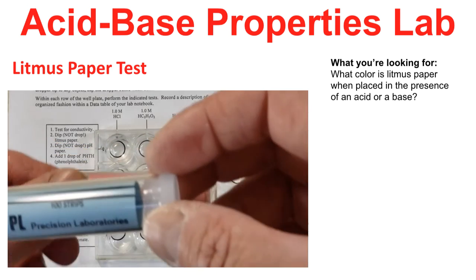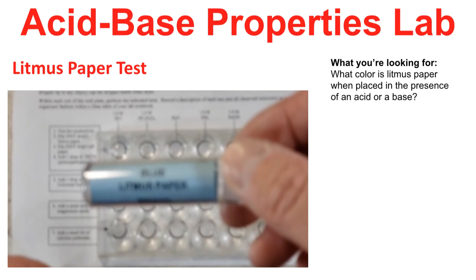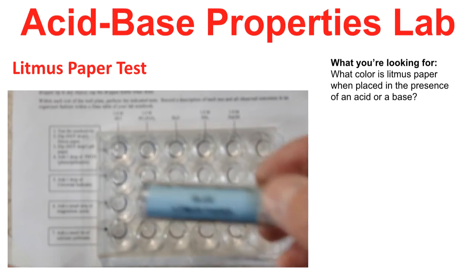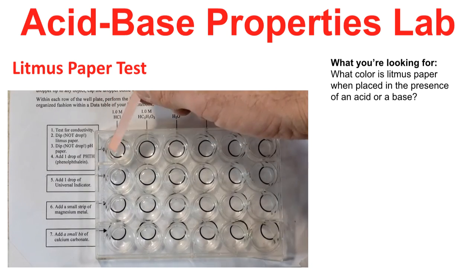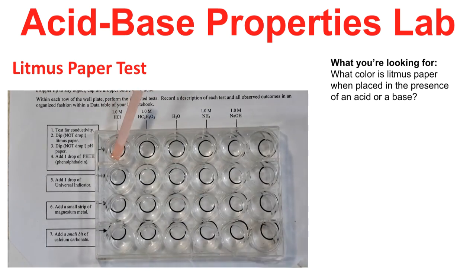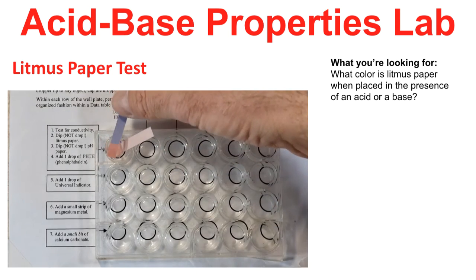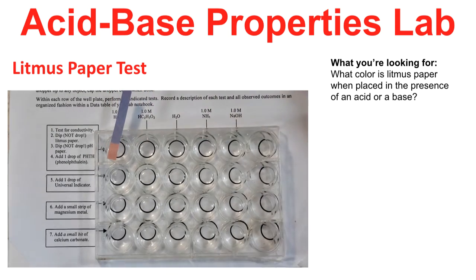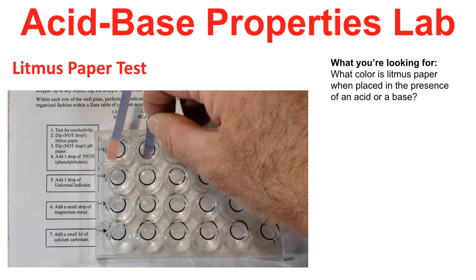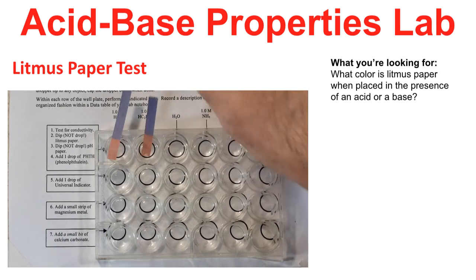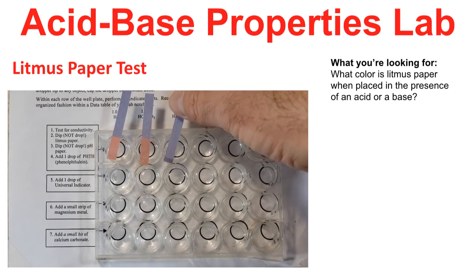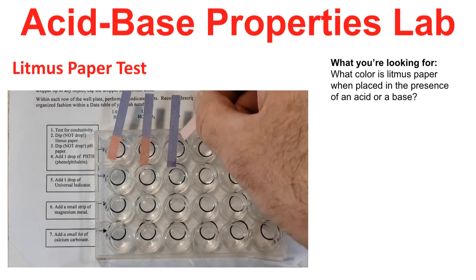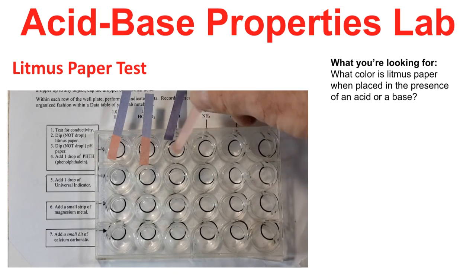Litmus paper serves as an indicator of whether a solution is acidic or basic, turning a specific color in an acidic solution and a different color in a basic solution. There's red litmus paper and blue litmus paper. Here we dip red in a solution — it doesn't turn color. So we dip blue in the same solution, and the blue turns red when placed in the hydrochloric acid. We also put a blue strip in acetic acid, and the blue strip turns red there too. We put a blue strip in water, and it doesn't turn color. The red strip in water doesn't change either — so litmus paper doesn't turn color in water.